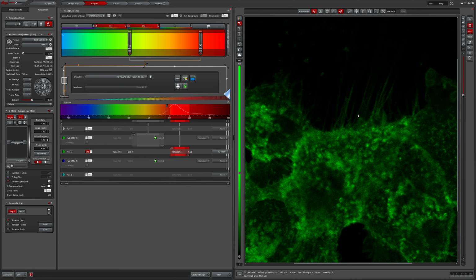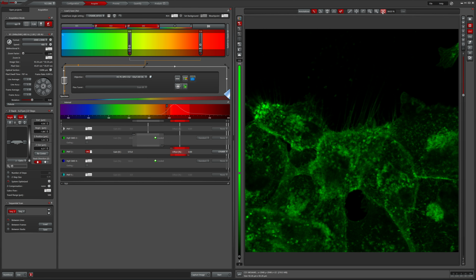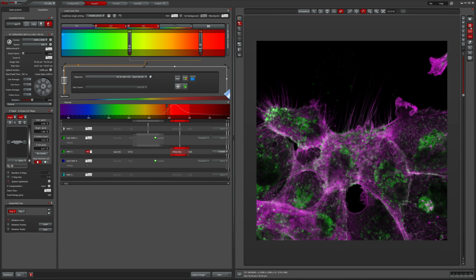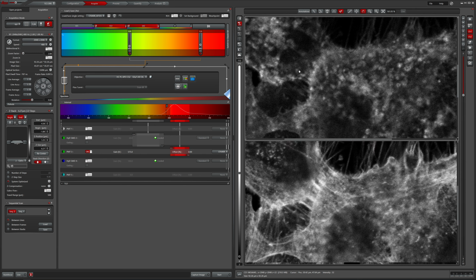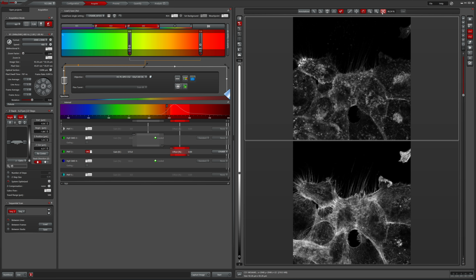Sometimes when you start, it'll be super zoomed in or zoomed out. So this fit to display size is helpful. If you want to move things around, this hand tool, of course. So say you've got split partitions and you're really zoomed into something. Instead of continuously hitting these, just hit this button.